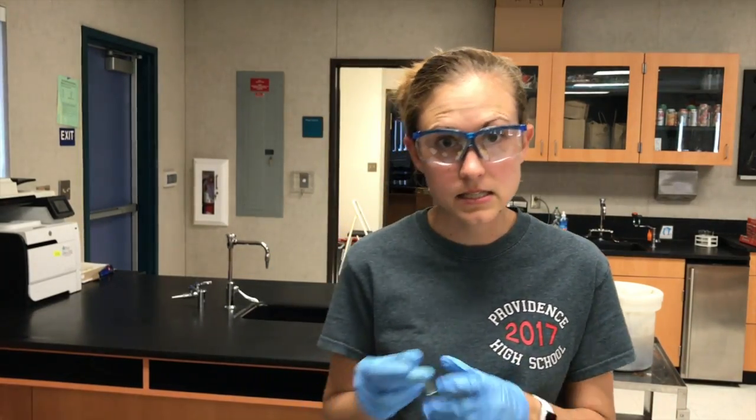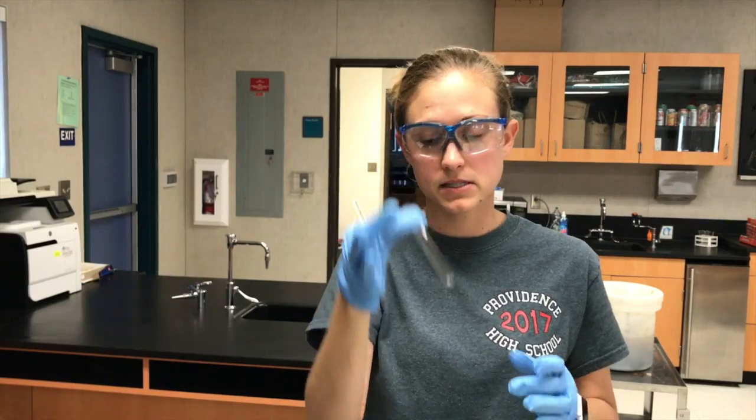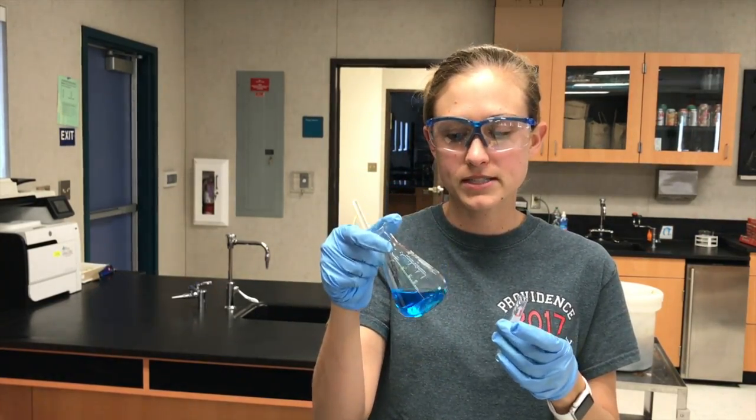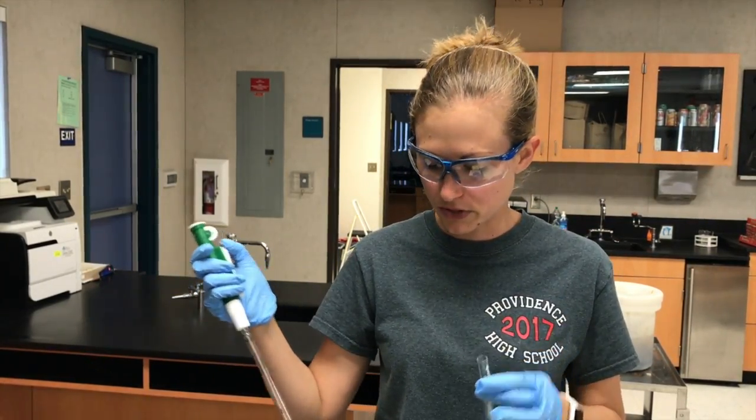So you're going to get a total of 6 cuvettes. Okay, so these are glass. Be careful with them because they can break. Now, I'm going to fill one of them with water, and then the other 5 are going to have solution. Well, I can add the 0.4 molar solution really easily and not have to do any calculations or any work. So what I'm going to show you is creating the 0.2 molar solution.